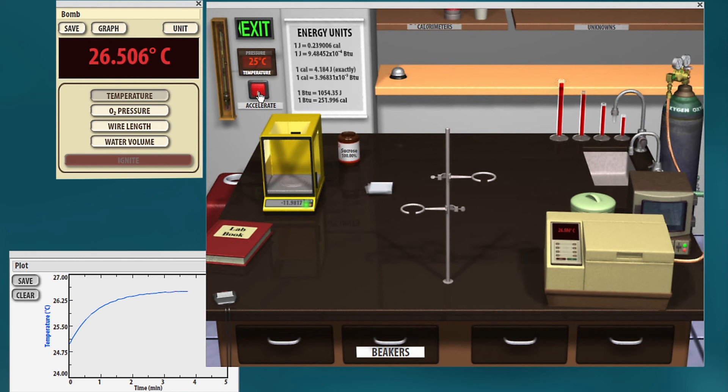Okay, this one's close to leveling off now too. What do you notice? What were the results? Did you get more energy from sucrose or from fat when you burn them? What does this mean for your diet and what you're eating?